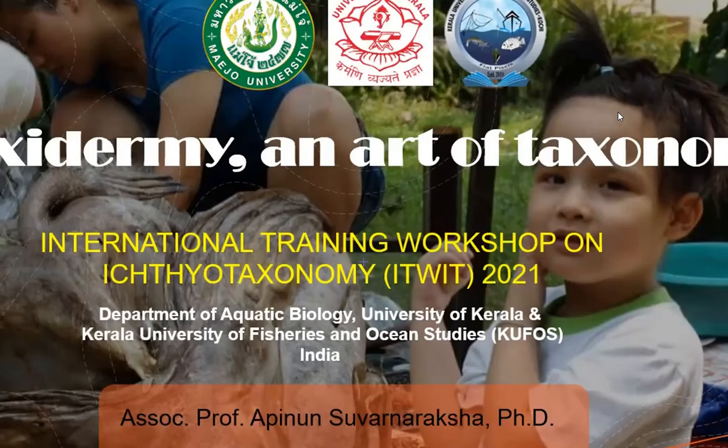We are so lucky because in Thailand we have a lot of giant fish, very huge ones, like Pangasianodon gigas and Catlocarpio siamensis, down to small ones. The big ones we can preserve as taxidermy, and the small ones we can do bone staining. We love it, and we did a lot in my lab with my students.